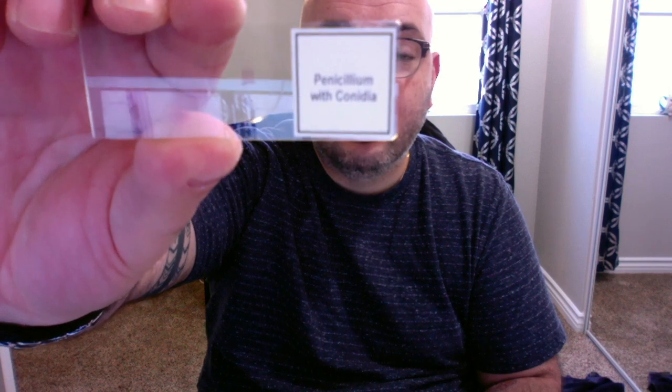So a relatively short and sweet results video, unfortunately. There is a second part that has to do, again, with this slide, the penicillium with conidia. That is a spore, and it's asexual, but there really isn't much for me to show you as far as the results video, because it involves taking pictures of this with a microscope and answering some questions related to how this penicillium works, and its economic value. So you'll see my answers or results to that in my final written report.